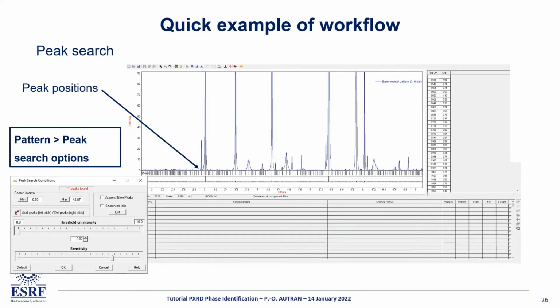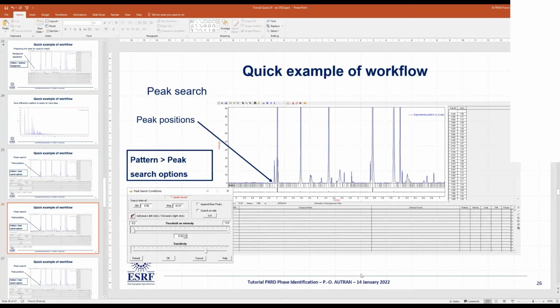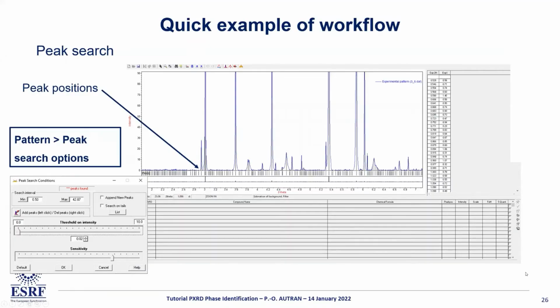If I reduce that, okay, maybe I reduced it too much now because I'm at 0, so it detects any little pixel at the very bottom, which is basically the noise remaining from the background smoothing and background subtraction. But you see that now my two little twin peaks in the middle are found, meaning that was the problem.